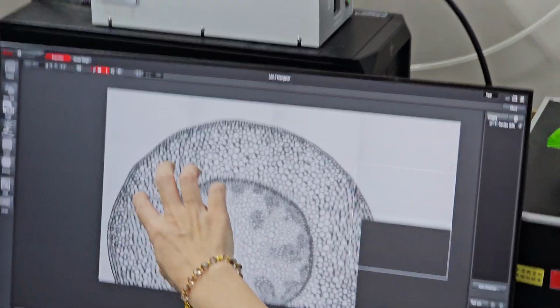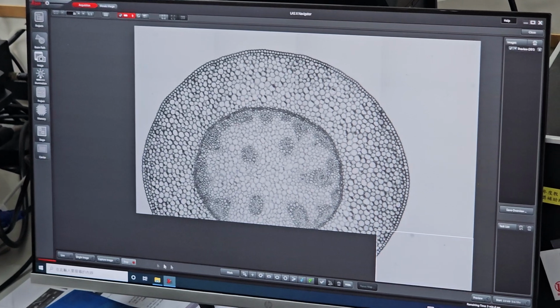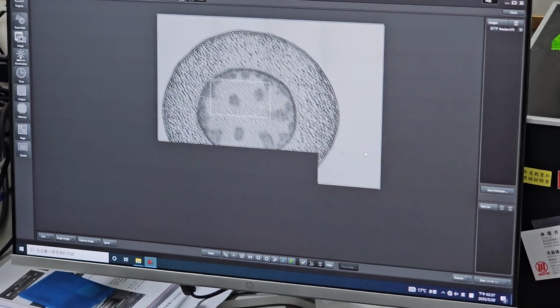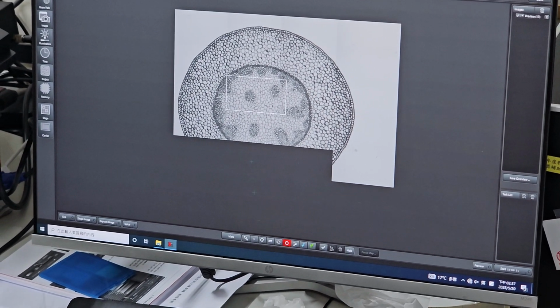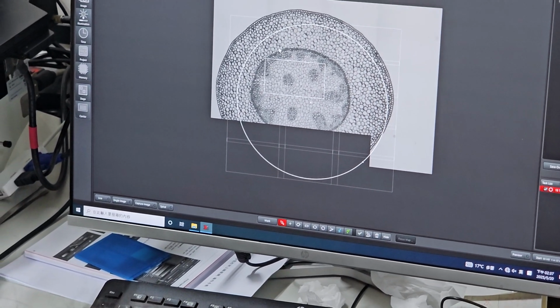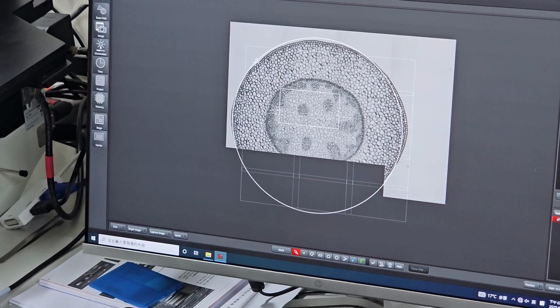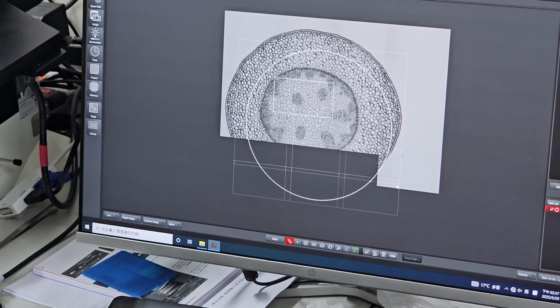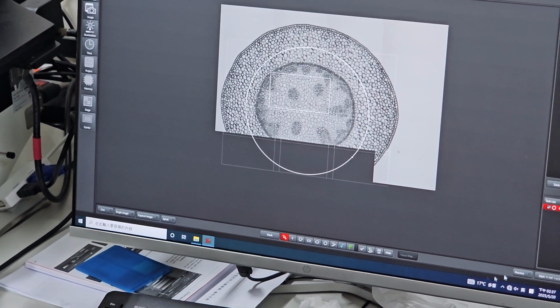If you want to do the whole sample stitching, we can use the region tool. Here is the region tool, to draw which area you want to apply, like this. You can close one and then start.